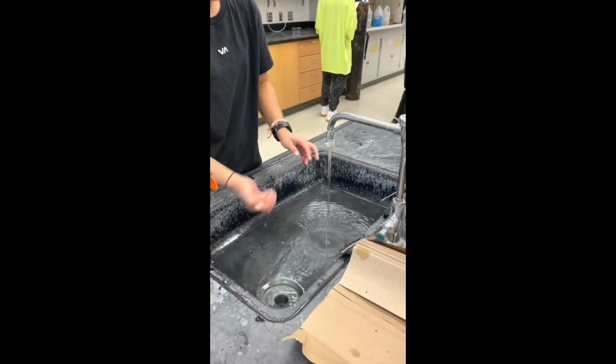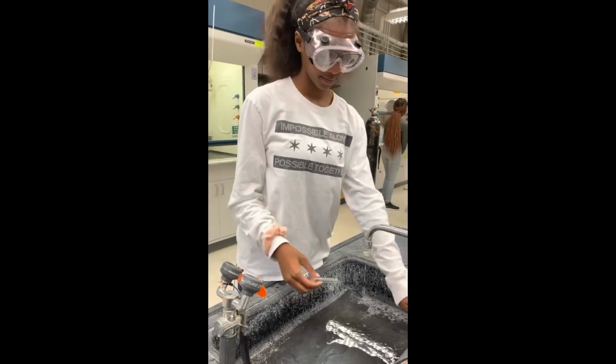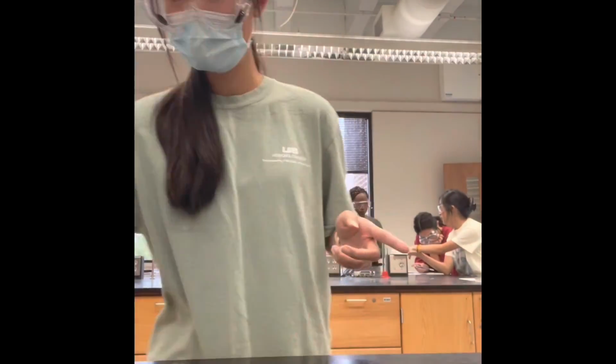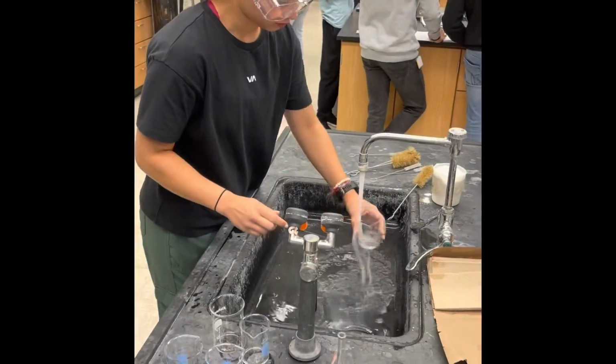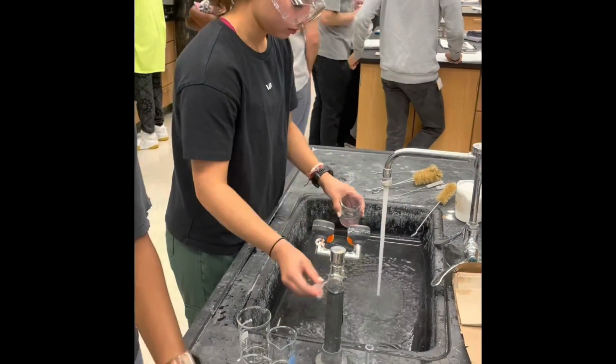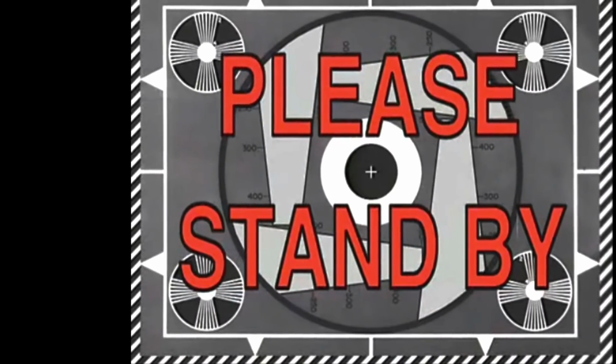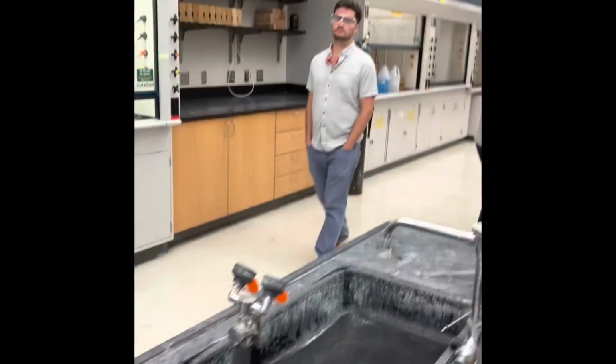When cleaning, you must dump all solutions into the sink located on the side of your lab table. Rinse through with water and dry with paper towels. Once completed, you will wipe down your lab table and you're done. I guess we can just do water and paper.